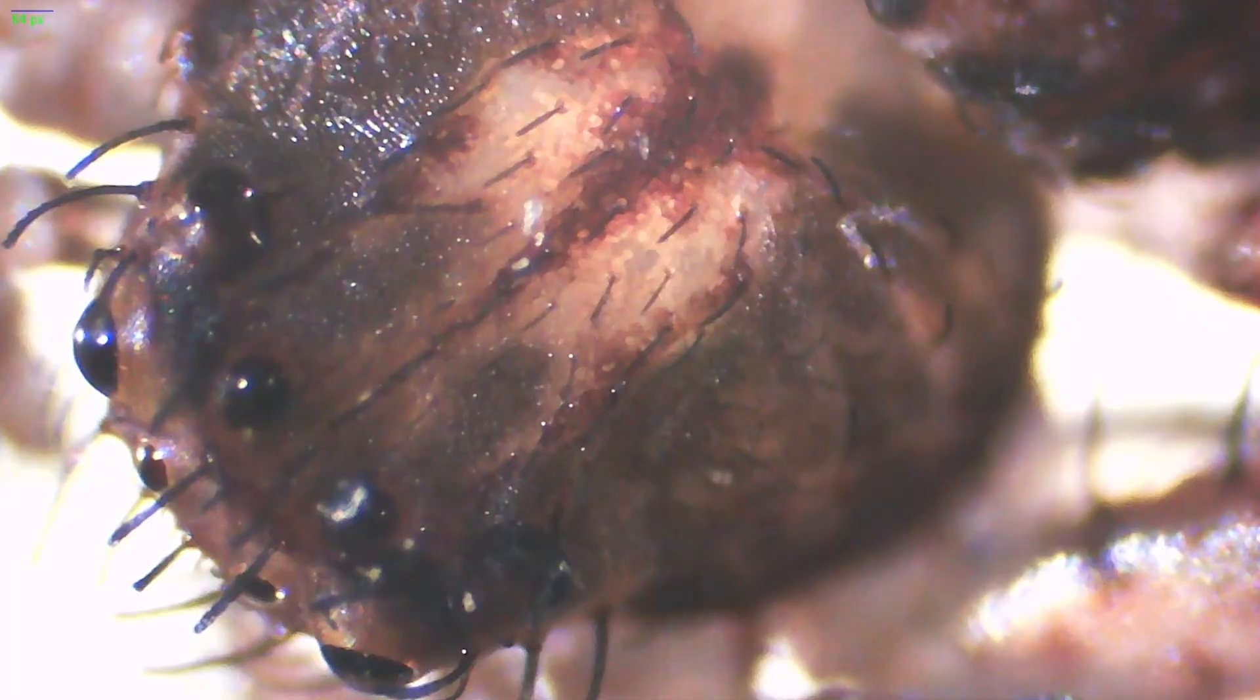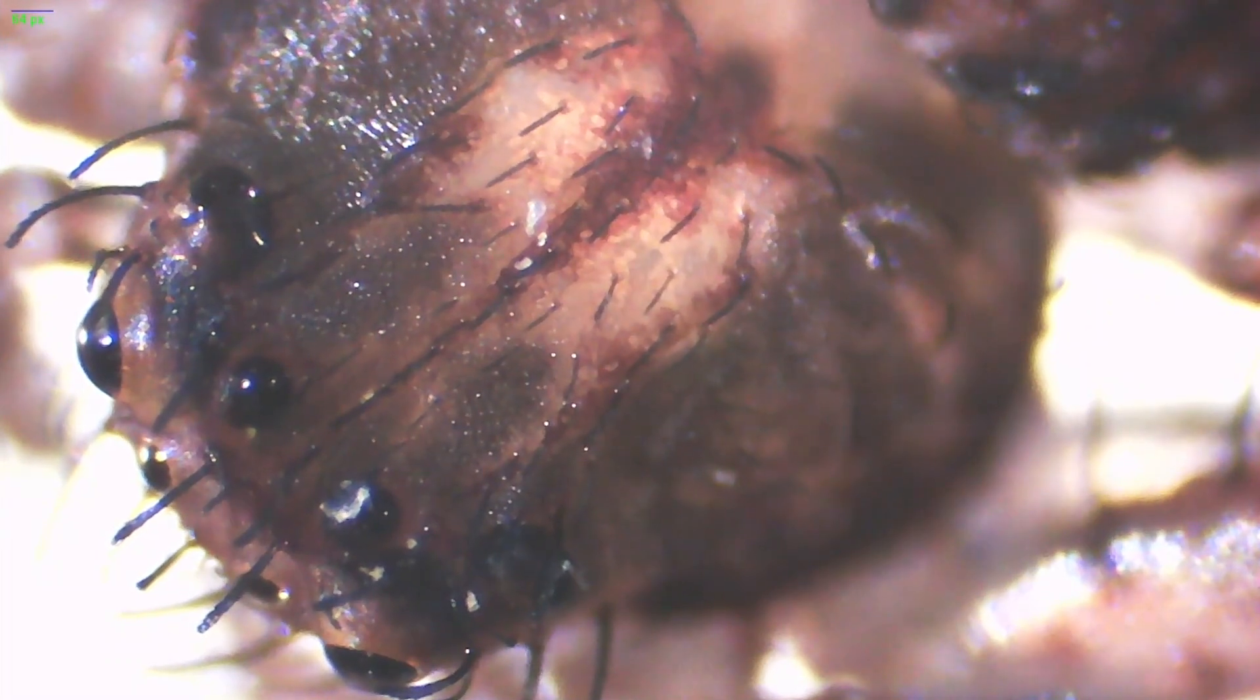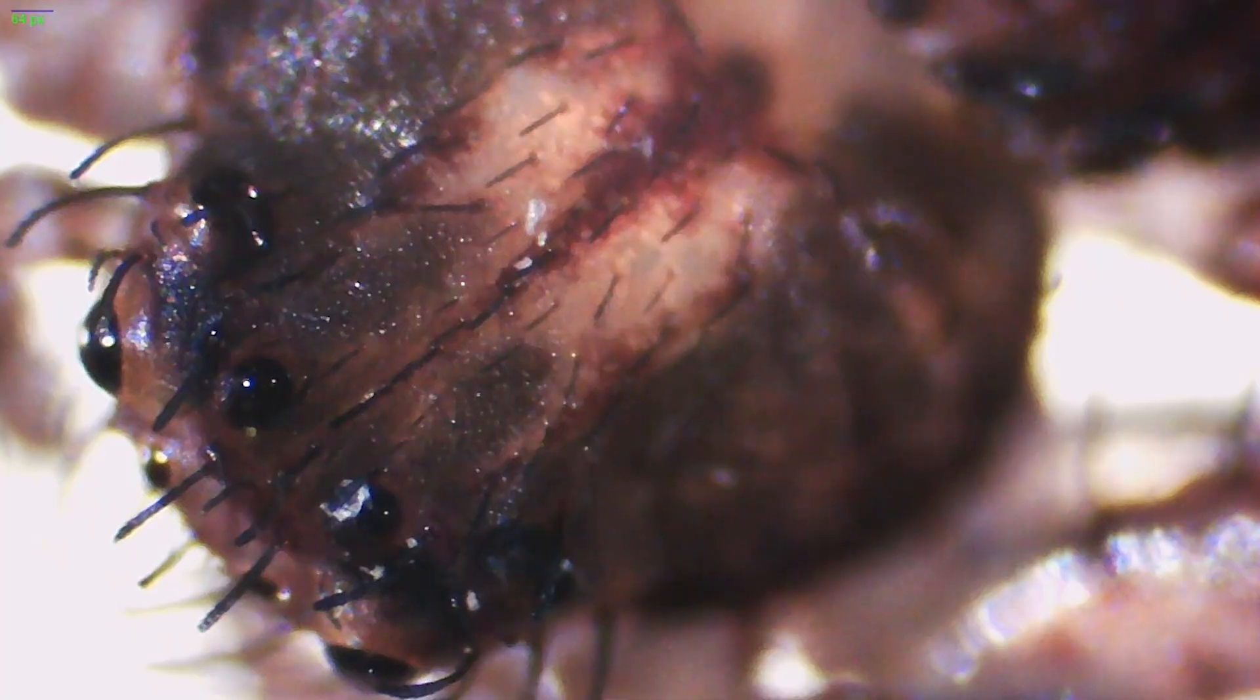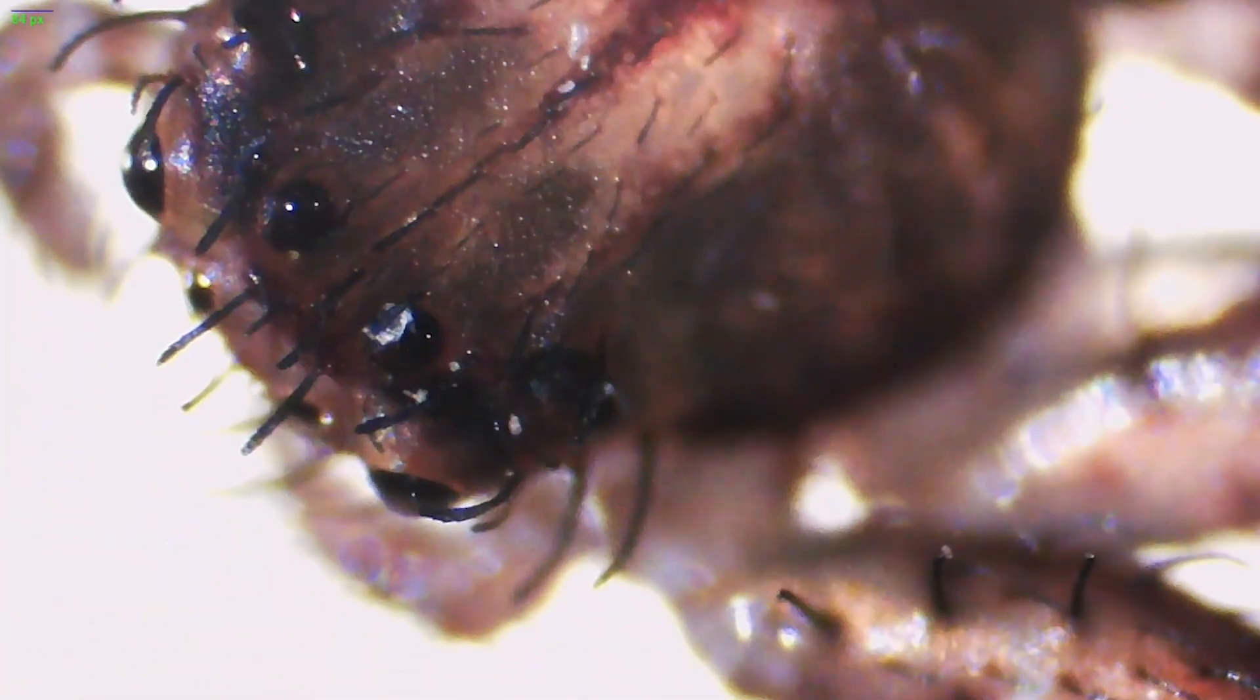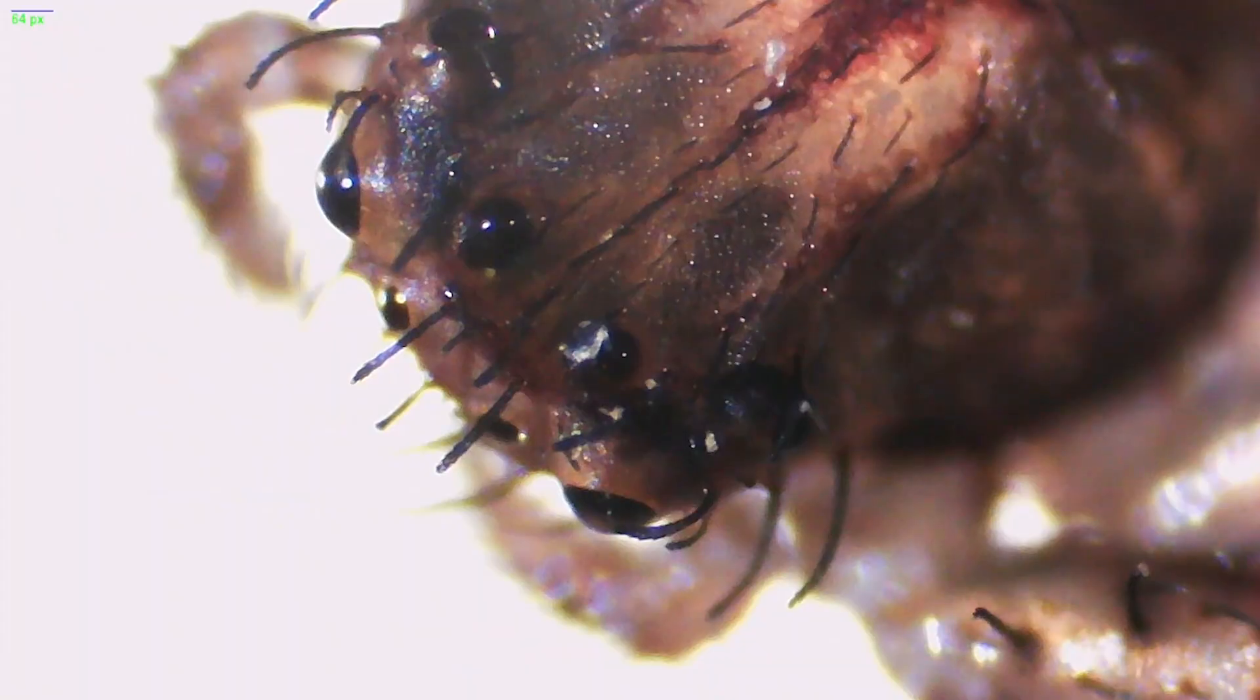It's so interesting on the eyes of spiders—they're always different or vary between the different species. Here we've got the eight eyes: one, two, three, four, four on the top, four on the bottom. On this guy, all the eyes are to the front of the face, a lot different than the jumping spider where you have eyes on the side of the head. Very fascinating.